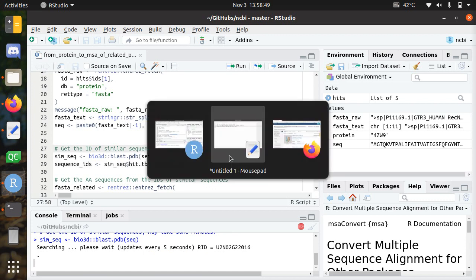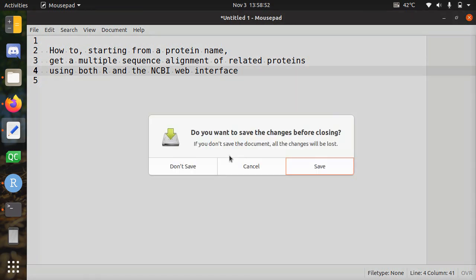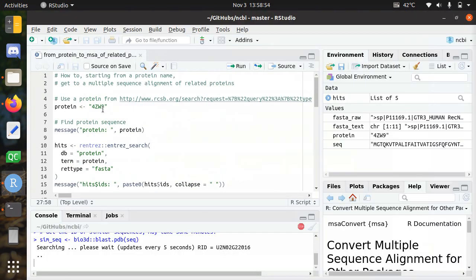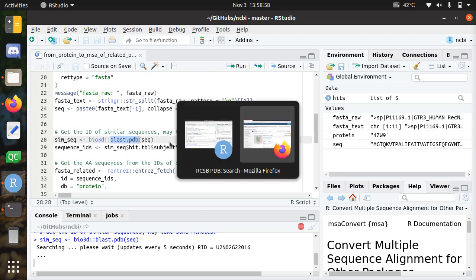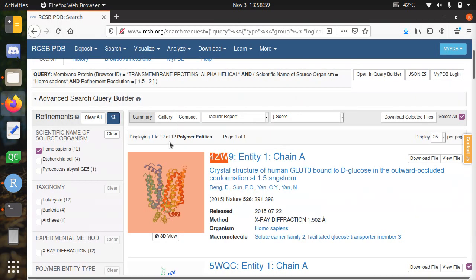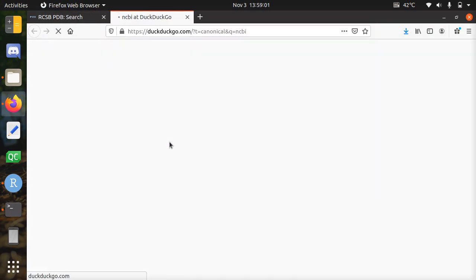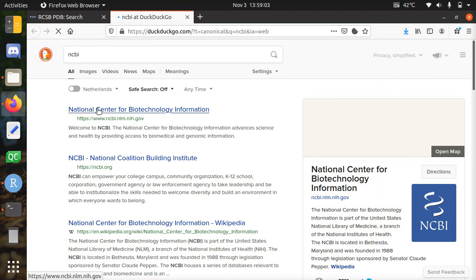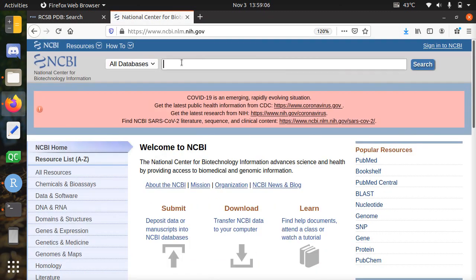So I'm now going to do the same thing in the NCBI website. I'll be copy pasting this sequence again. So to get to the NCBI website, you can google it or you can type in the URL, that's all fine.